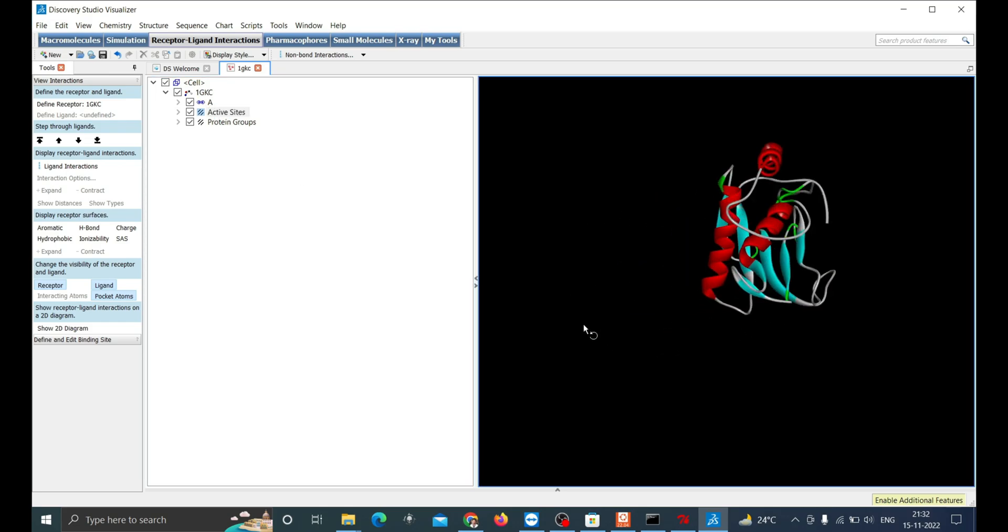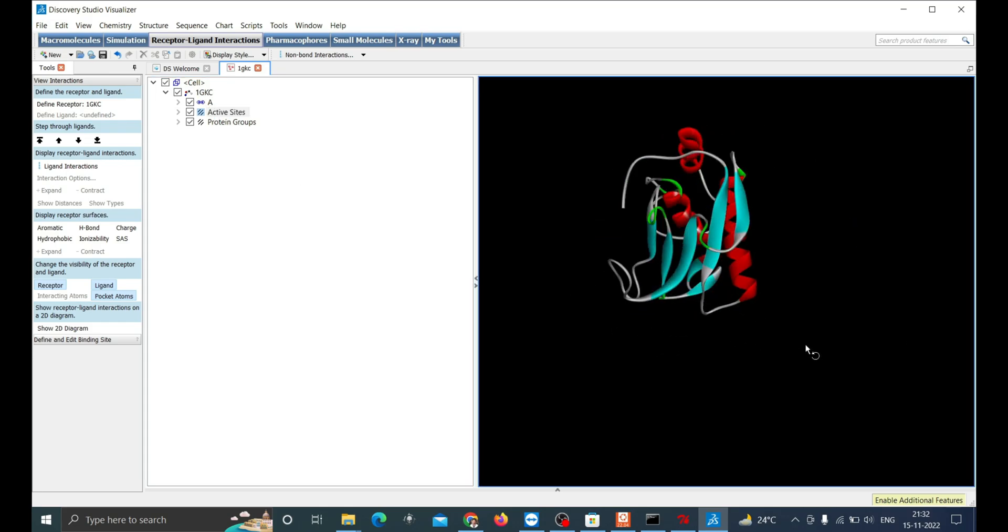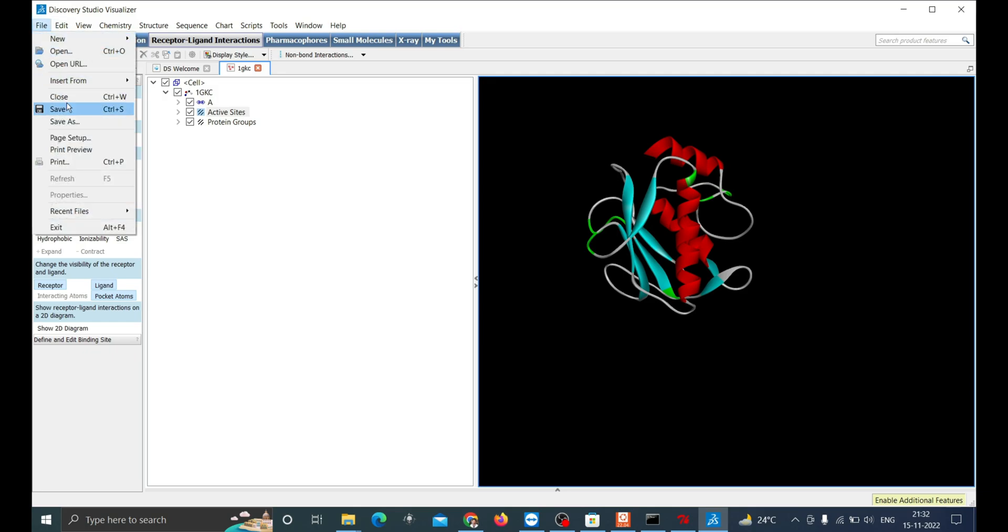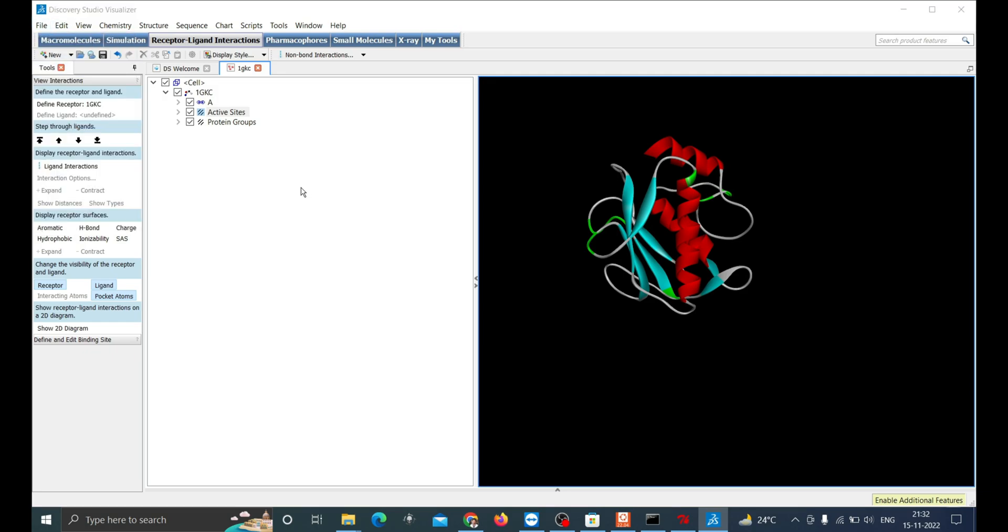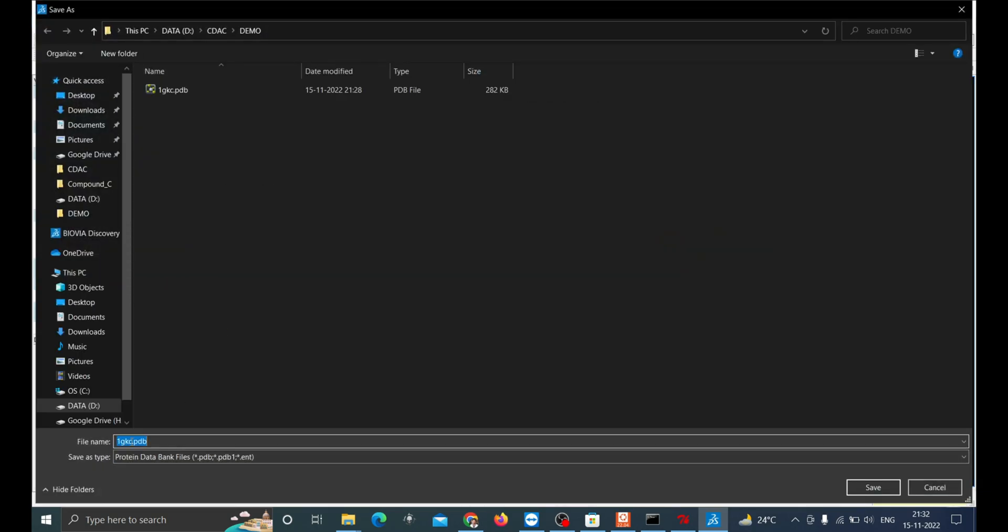Now we have the protein monomer without any ligand or water molecule or additional chains. Let's save it as 1GKC_filtered.